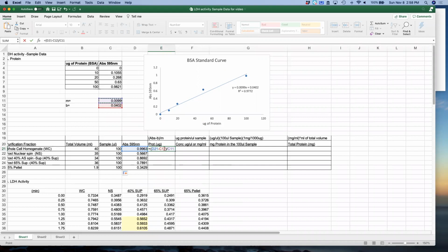So what I'm going to do is put a $ sign in front of both the letter and the number. And what that's going to tell Excel is to hang on to that and to not change it when I drag it down. So let me show you what that is going to do, right? So now when I pull this down, magically, oh, it's so cool.